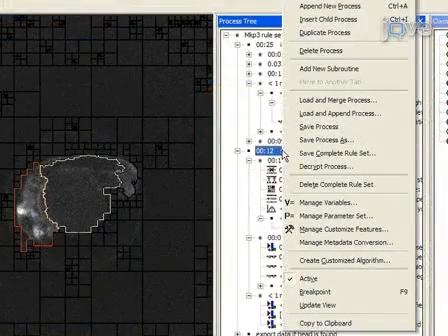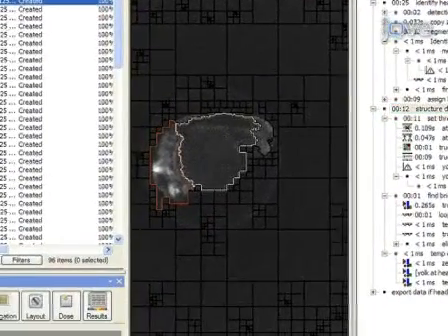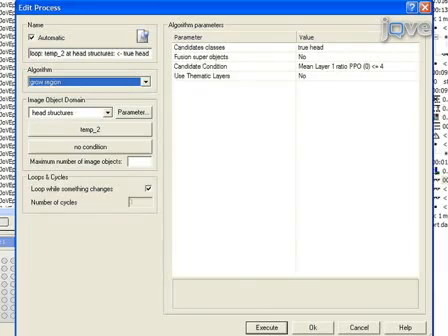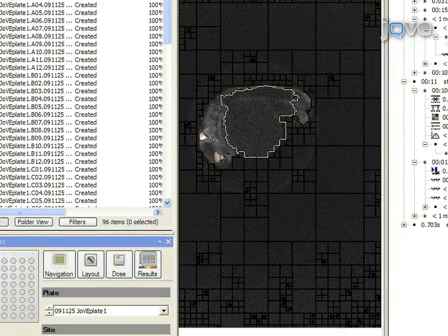Next, execute the rule set to the stage of bright head structures detection to ensure proper assignment of GFP-expressing areas in the head. Modify the rule set to adjust the head structures detection threshold as multiples of mean yolk intensity until the detection of bright head structures matches visual observation.